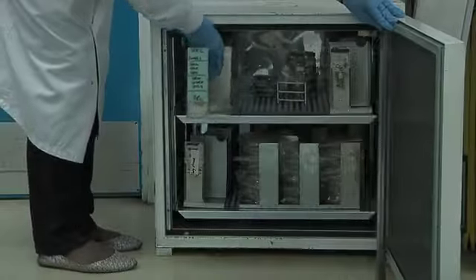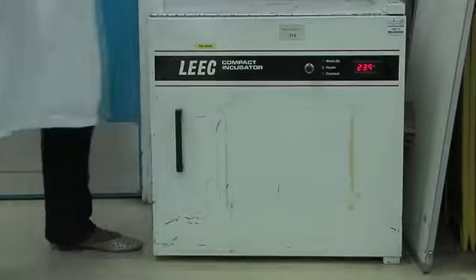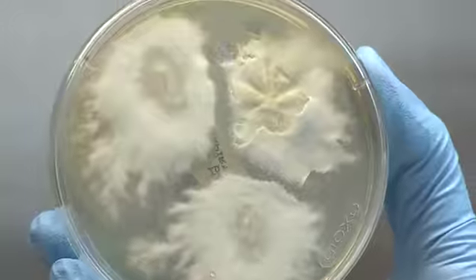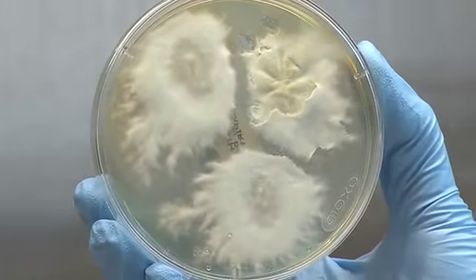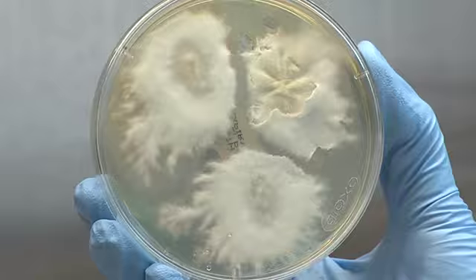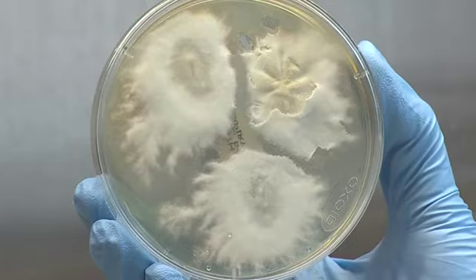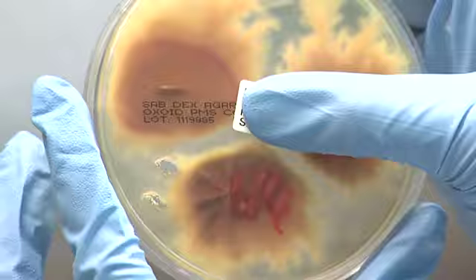On examination of cultures, identification of fungal growth is made by describing the growth, the colony morphology, is it flat, folded or submerged, the colony texture, is it floccose, waxy, granular or powdery, the colony surface colour, and the colour of the reverse pigment of the colony on the underside of the plate. This isolate from the toenail clippings shows a cream, flat, powdery colony with a brown cream reverse.